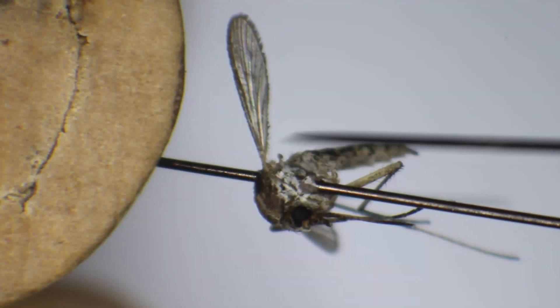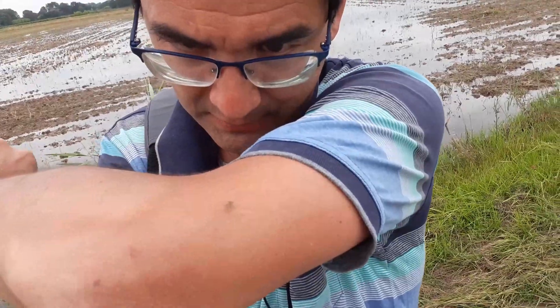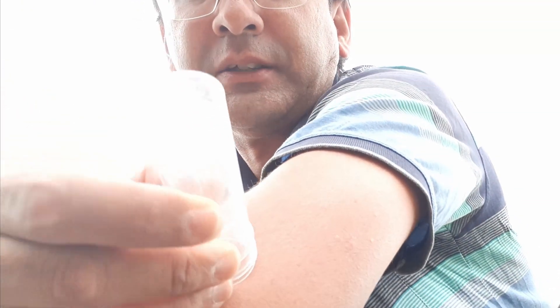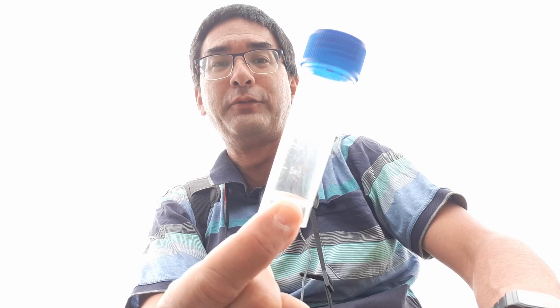Hi, MicrobeHunter here, and today I'm going to put a mosquito under the microscope. Even though there are so many mosquitoes here, I still find it difficult to catch some of them using my little container. I have to wait until they sit down and then quickly put the container over them. There is a mosquito sitting on my arm feeding itself — I wonder if I can catch it. Okay, got it! I proudly present a mosquito of southern France.